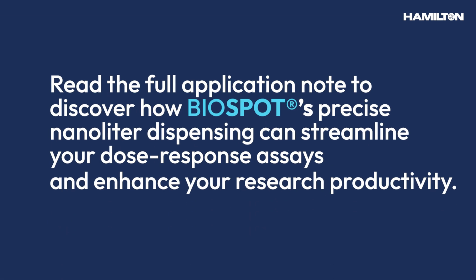Read the full application note to discover how BIOSPOT precise nanoliter dispensing can streamline your dose-response assays and enhance your research productivity.